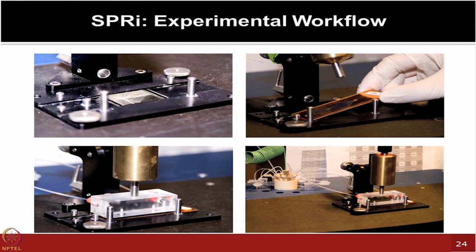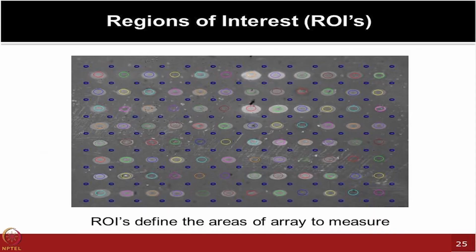So these kinds of platforms could be used, and they result in these images, which are the pseudo images that I mentioned to you. It shows you these spots. All these red and green ones are actual spots, but the gray color is just the background. So the software artificially adds some blue colored dots. These spots could be used for subtracting the background. In this way, you are ready to test a lot of molecules, unlike the 4 you can do just by using the existing technologies.